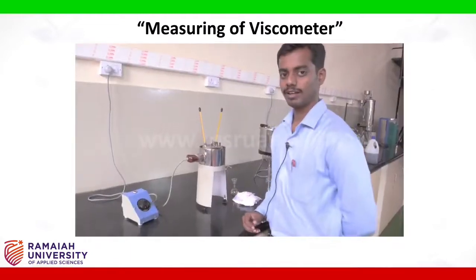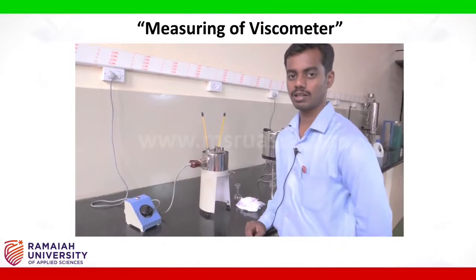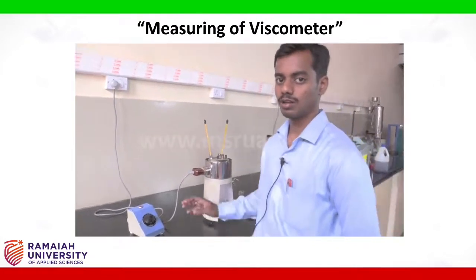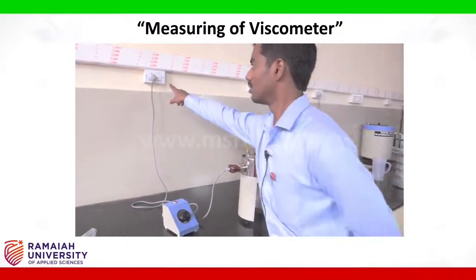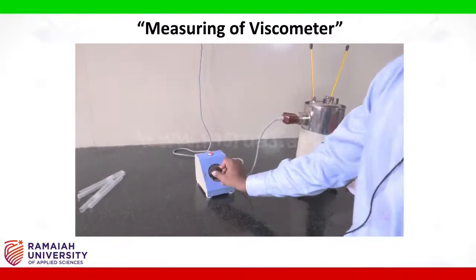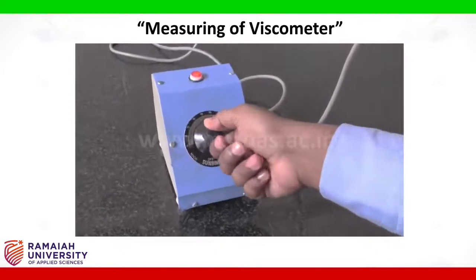Now we shall heat up the oil by heating the water first using the coil inside the water jacket. The coil will be switched on by the heater. We shall switch on the mains of the heater and start by giving some voltage regulation.